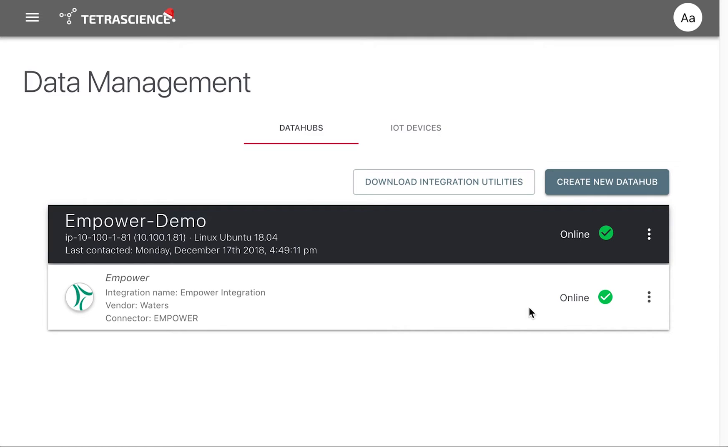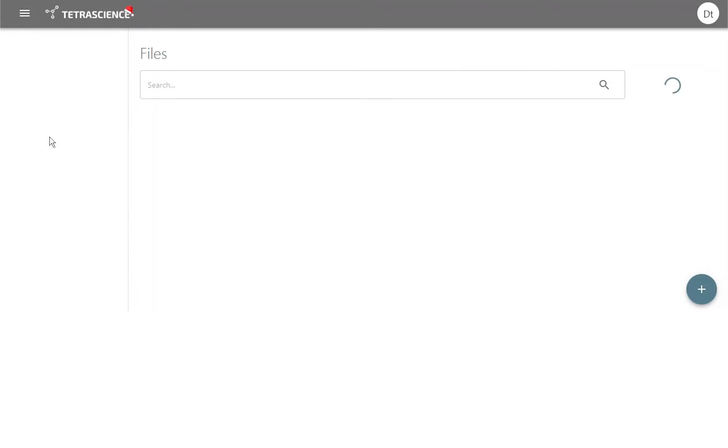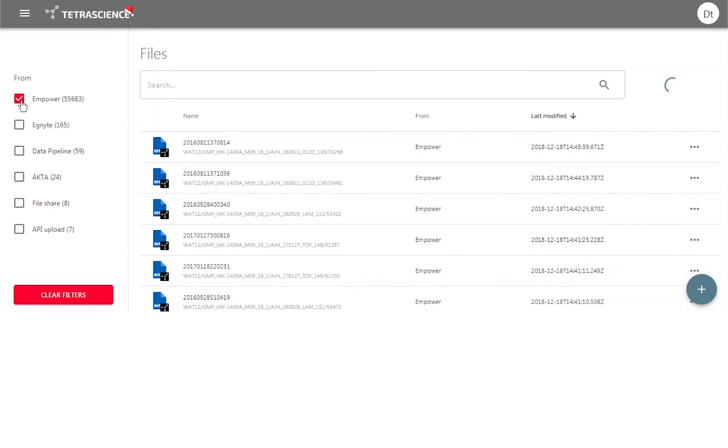The agent monitors the Empower database. When a new injection is created, the agent automatically extracts its data, formats it as a JSON file, and uploads it to the Data Hub.